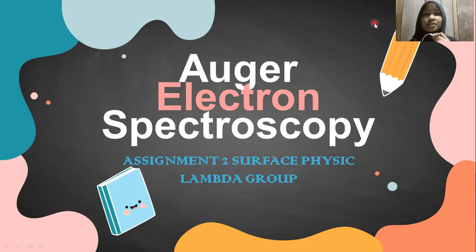In this presentation, we will discuss Auger Electron Spectroscopy.